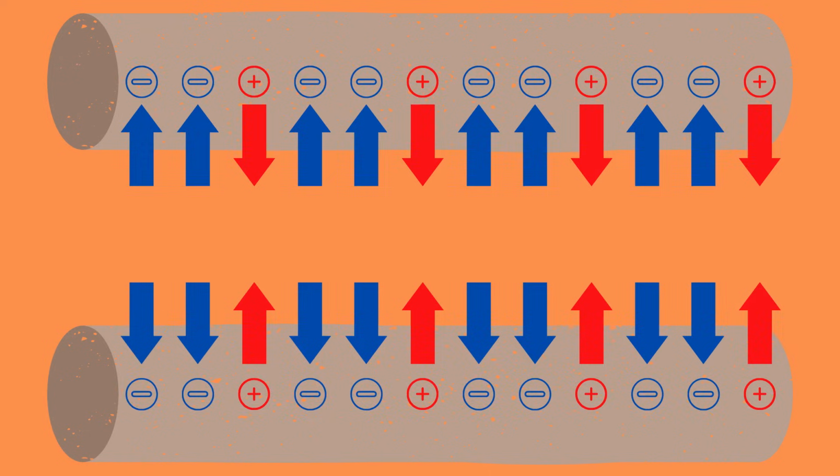On the other hand, in the y direction, heavy ions will be unstable because of the defocusing effect of the DC component, but some lighter ions will be stabilized by the AC component if its magnitude is such as to correct the trajectory whenever its amplitude tends to increase. Thus, the y direction is a low-pass mass filter, i.e., only low masses will be transmitted to the other end of the quadrupole without striking the y electrodes.